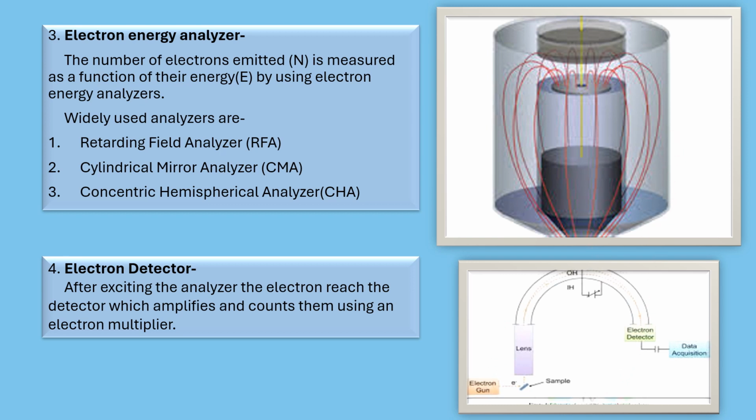So what they actually do is they count or quantify the number of electrons emitted, and that is measured as a function of their energy. We will be further using it for analysis.